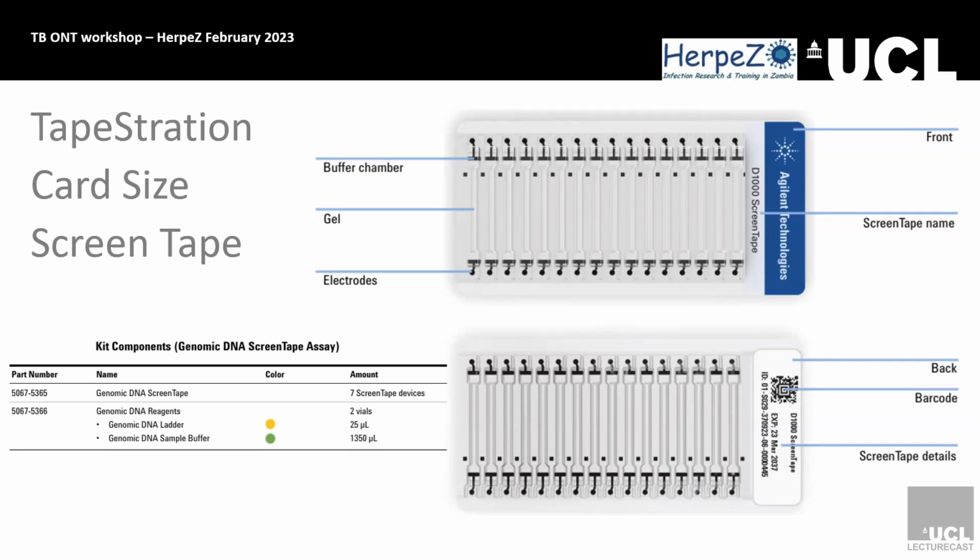What about the Nextera XT now? It's now DNA Prep. You don't need to do the individual fragment analysis like before, so it's much more focused. It wasn't forgiving before; it's much more forgiving now. So if you are doing sequencing on a fairly big scale, then it's definitely worth automating this process if you can.